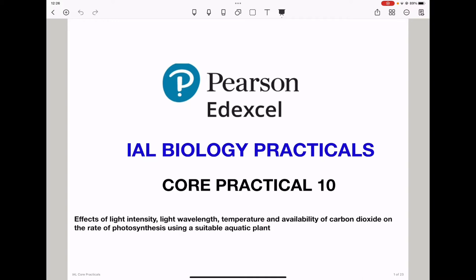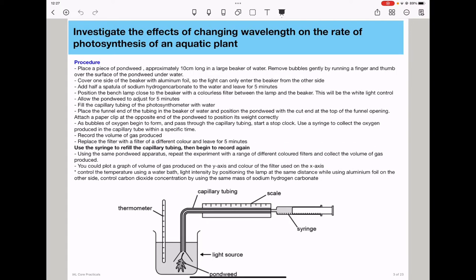This is part 2 of this experiment. Here I investigate the effects of changing wavelengths on the rate of photosynthesis of an aquatic plant. So this is the experimental setup.